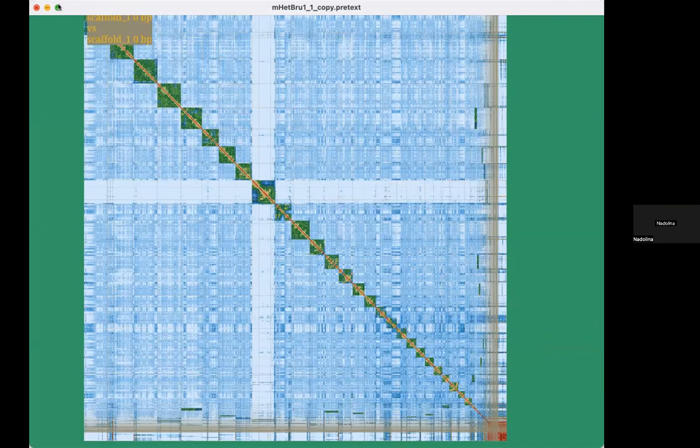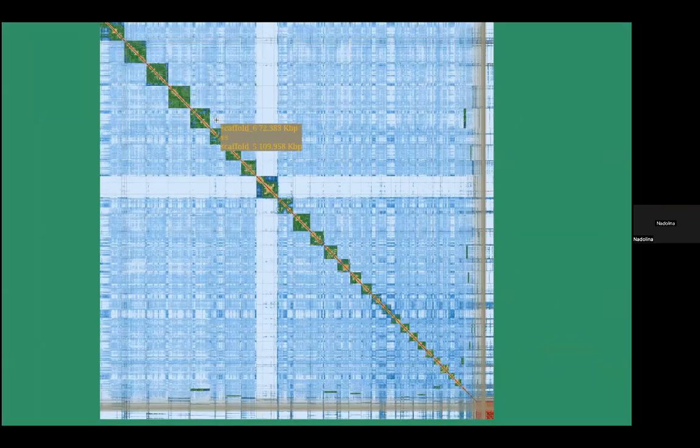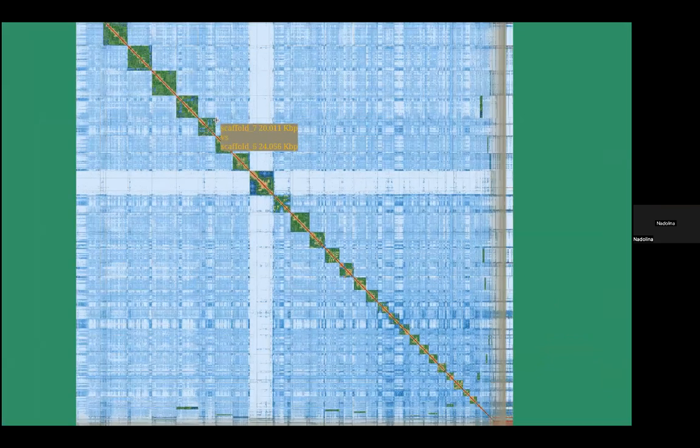Okay, so I'm going to take this slow because I know for whatever reason, pretext view can be a little bit laggy over Zoom. The other thing that you're going to have to be aware of as I'm demonstrating this is that pretext view does have a tendency to jump around. So when you do move pieces around, sometimes you'll lose track of it, but we'll find it again. We'll just go slowly and we'll make it work.